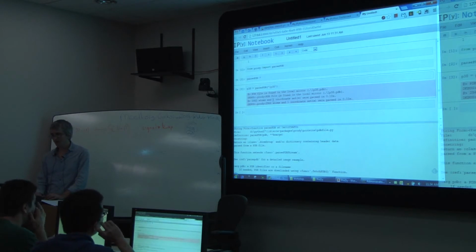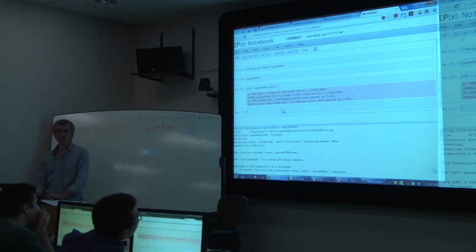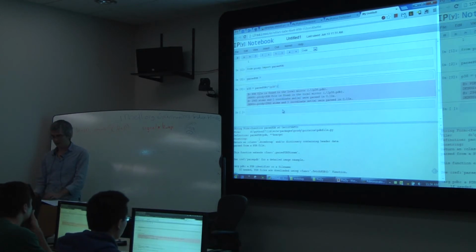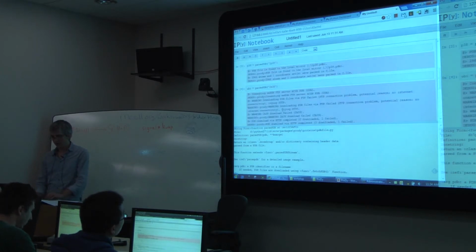Now this one coordinate set means it is one model. If I type another ubiquitin file, it will be 2K39. You will see something different.